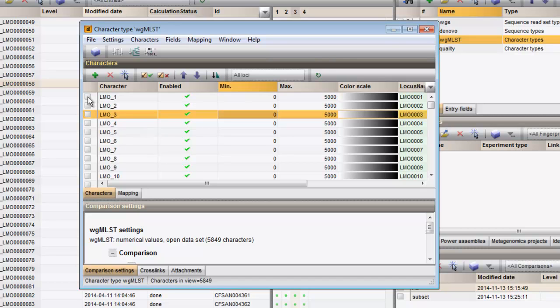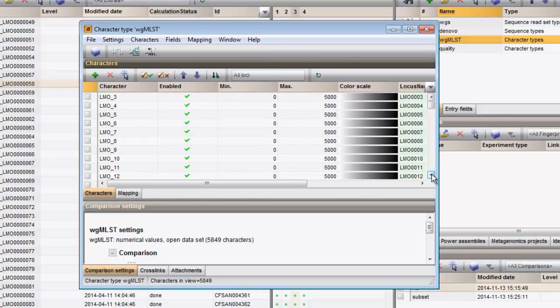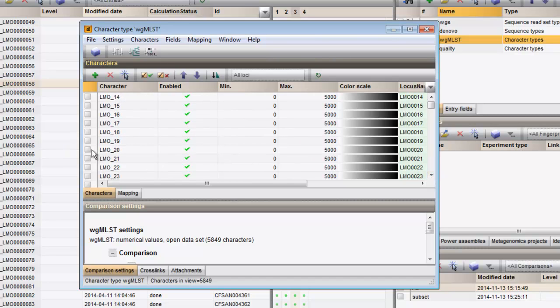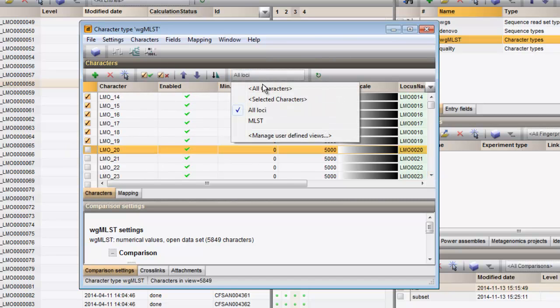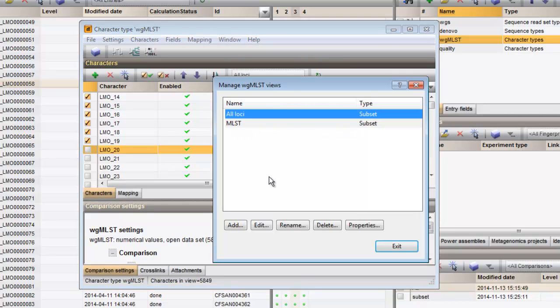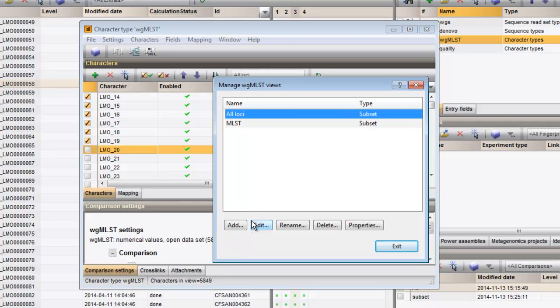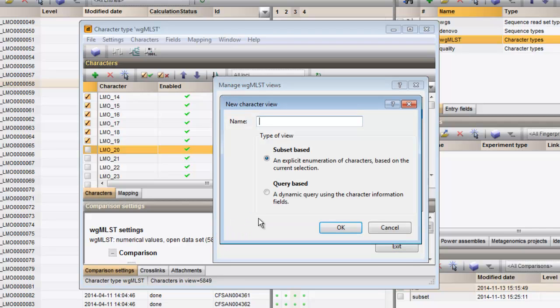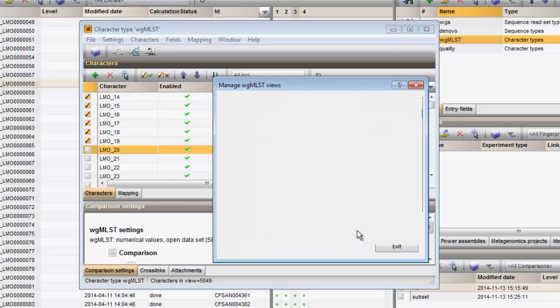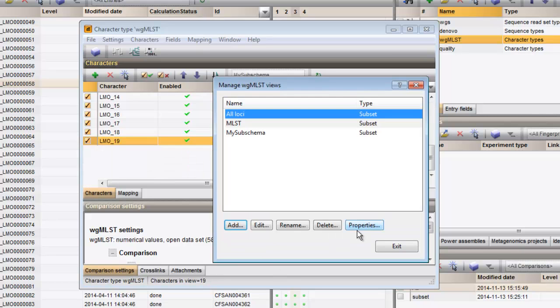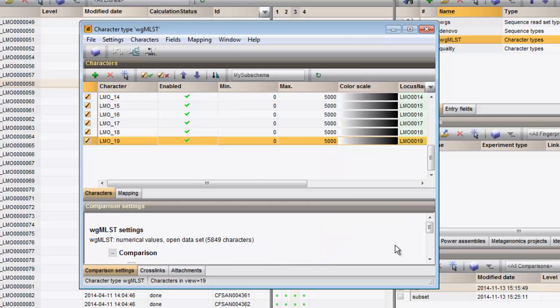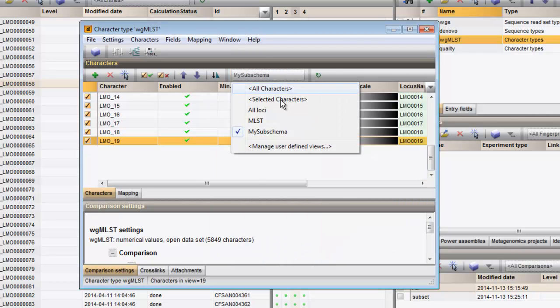I select the number of Loci and I add a new view. I can now toggle between the different views.